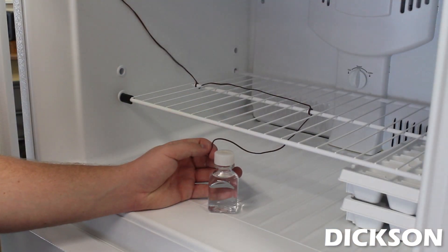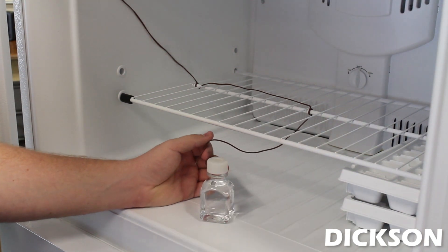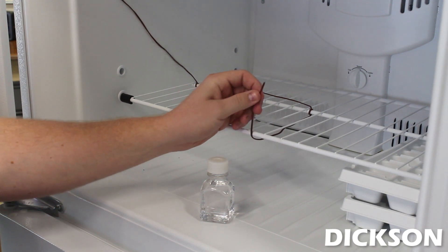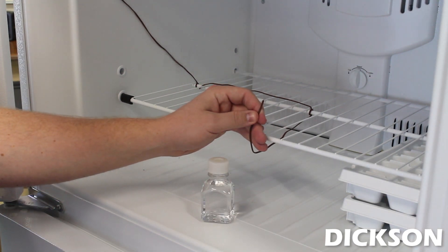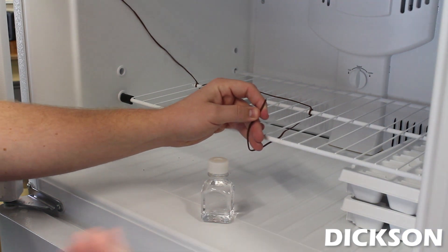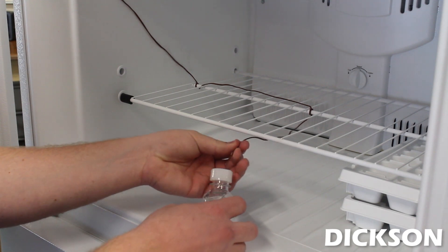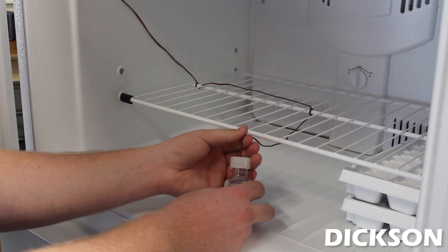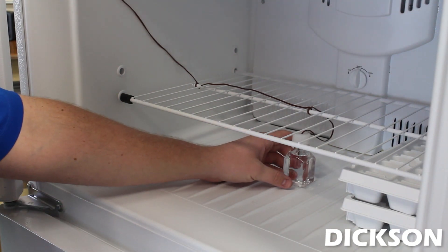Another product Dixon offers is our glycol bottle. The reason this product is used is to provide stability in our freezers and refrigerators. Our K-type thermocouple reads the temperature from a small bead on the end of this probe. And when you open a freezer or a refrigerator, you get a large influx of air flow. So the reason this glycol is used is to eliminate that air flow. You easily just poke a hole in the top of this bottle and run your probe in.